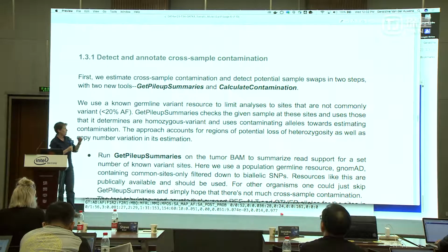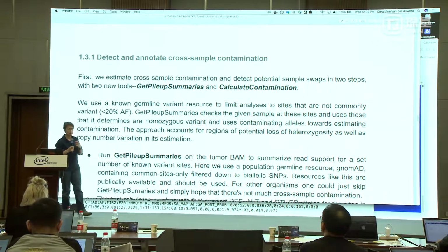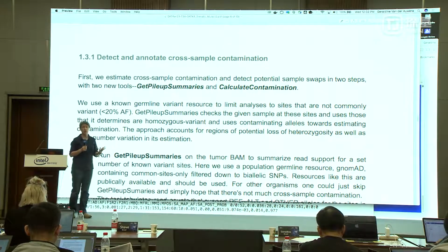And so we see that in pretty much all samples that go through our pipelines, through our facility, there's always some small amount of sample contamination. This is something we started worrying about some years ago because there was one project in particular, and I'm not naming names, that had extremely high levels of cross-sample contamination that caused severe problems in the analysis.